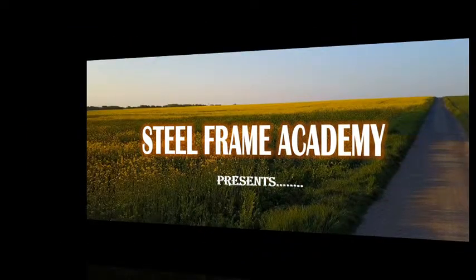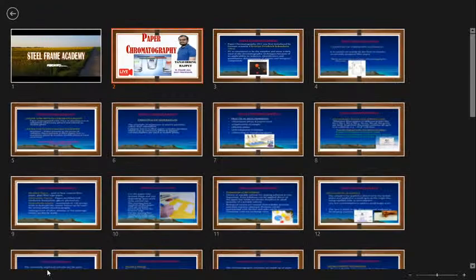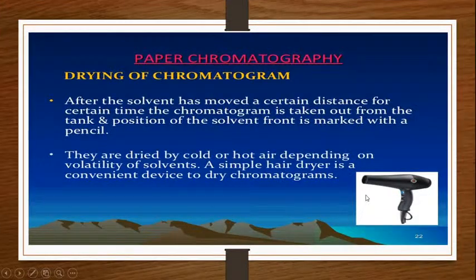You all know we have started with paper chromatography. The last section which we left out in the previous discussion was regarding visualization or detection. So sequentially we will summarize it. Yes, we have dried the chromatogram.